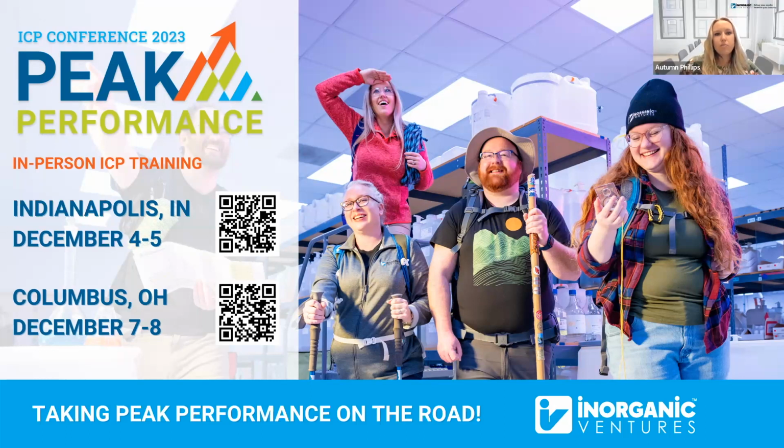All right, and the next question: if precision is only an issue with specific metals, for example aluminum, do you have any recommendations besides making a tighter calibration curve for that given metal? Well, precision does not necessarily correspond to the tightness of the curve. It's actually more of an accuracy issue than precision. Precision is the consistency of your results, or the low value of your RSD, relative standard deviation. So I'm not quite sure how to answer this question. If it's aluminum as an element or aluminum as a matrix, and it relates to precision, not accuracy, then you may have to look at how much sample goes into the plasma. Maybe the power needs to be brought up to compensate for the load.